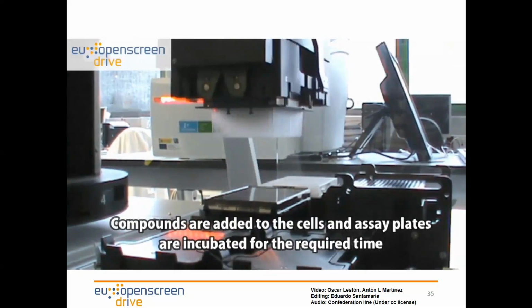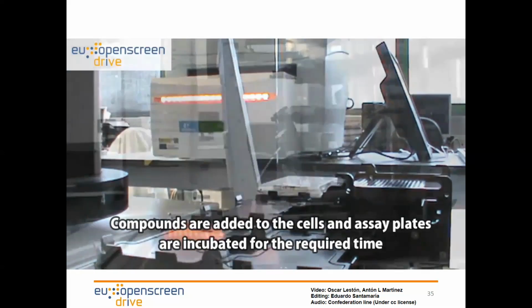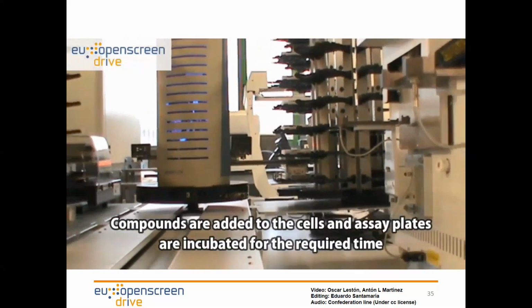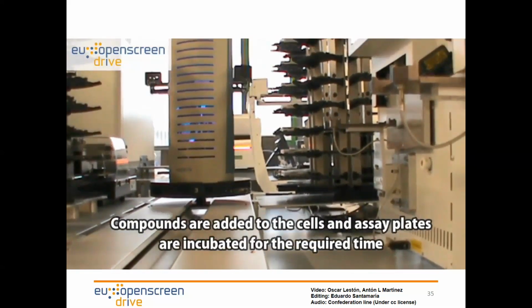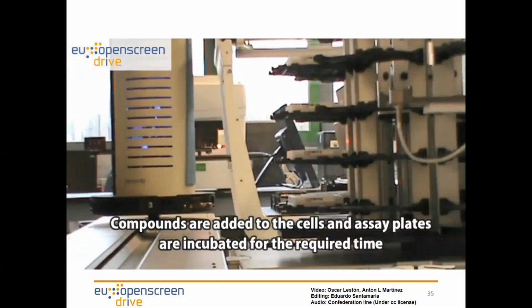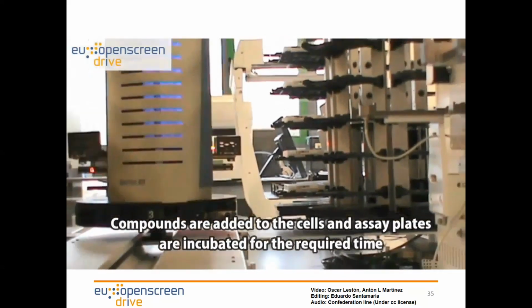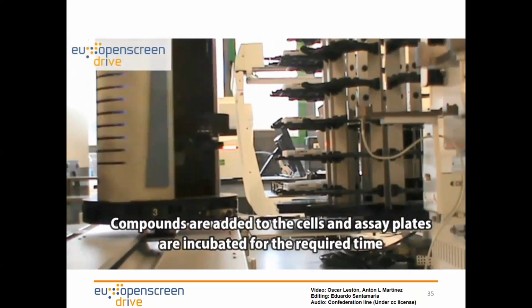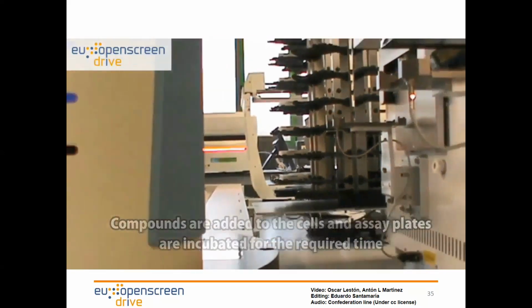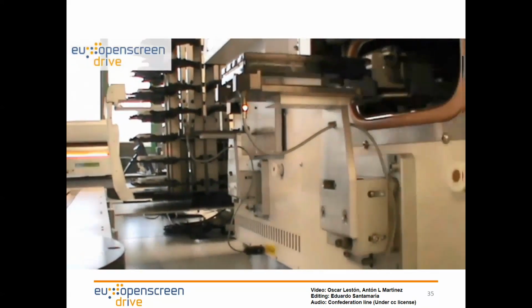Once the compounds were added into the cells, the robotic arm removes the compounds from the liquid handler and returns them to the source where they were located, and then takes the cells from the liquid handler and puts them into the incubator, where they are going to be incubated for the required time and at the required temperature, depending on the assay you have previously developed, in order to observe the effect of the compounds on the plate. As you may see, the robotic arm is moving all the plates with the cells to the incubator, which is at 37 degrees in this case and 5% CO2.